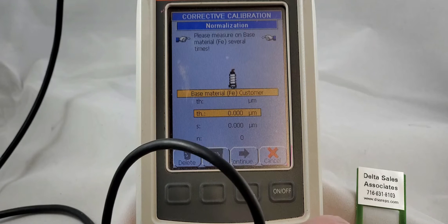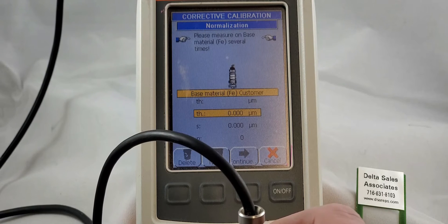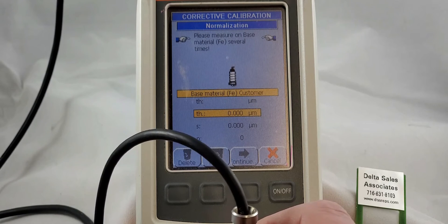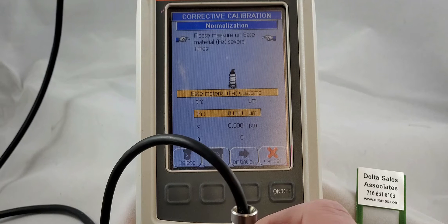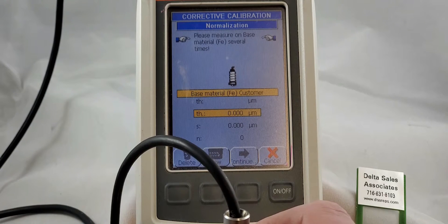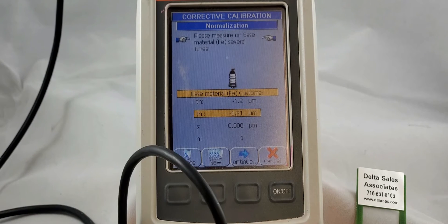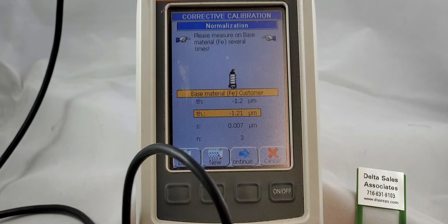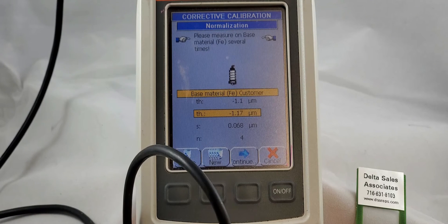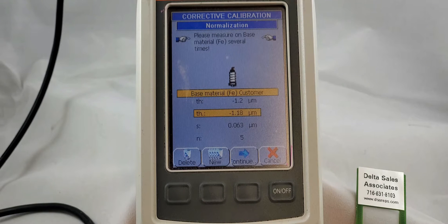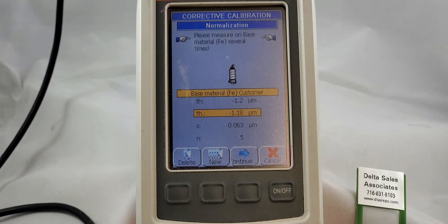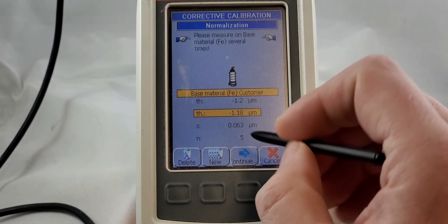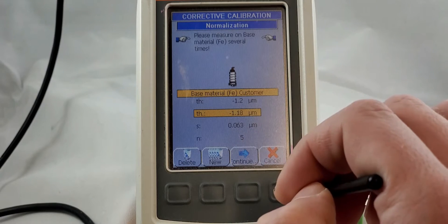I'm going to go ahead, I'm going to take five measurements on here. I like to use five because it gives me a nice sample size to work with and a nice average. So one, two, three, four, and five. The numbers that we get for these results really don't matter. So we're going to hit continue.